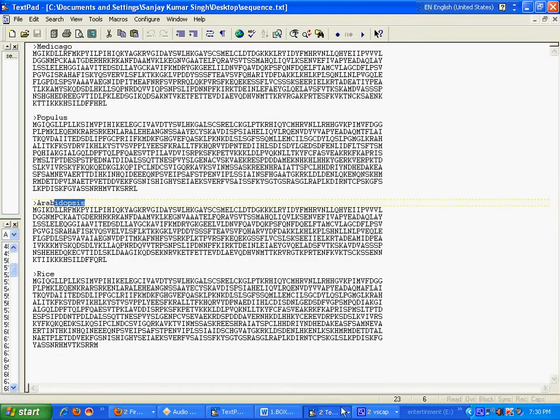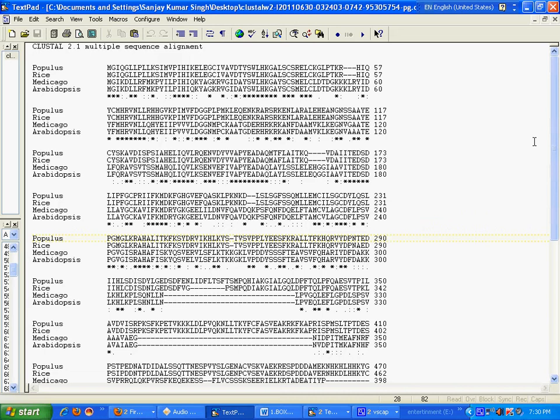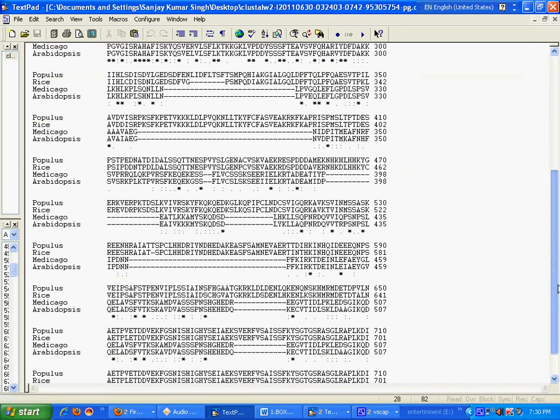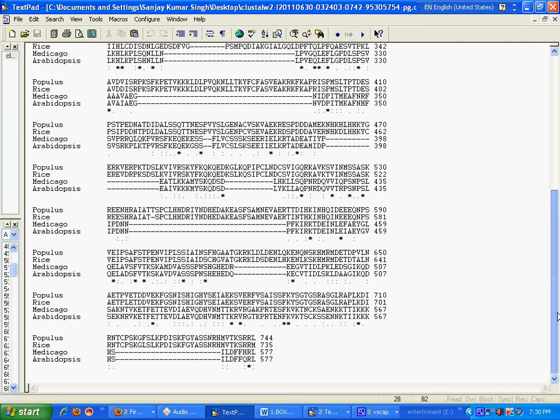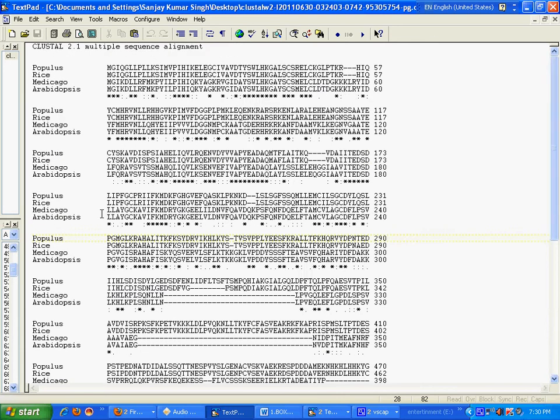This is my sequence file. And this is my alignment file. Now I want to give this file, the multiple sequence alignment file, to another server.